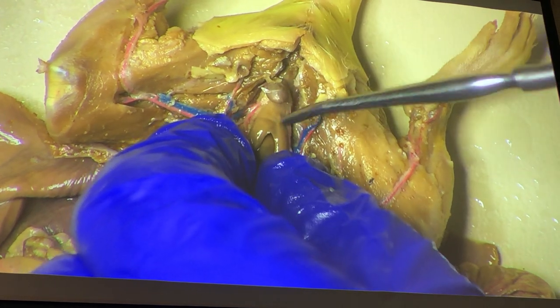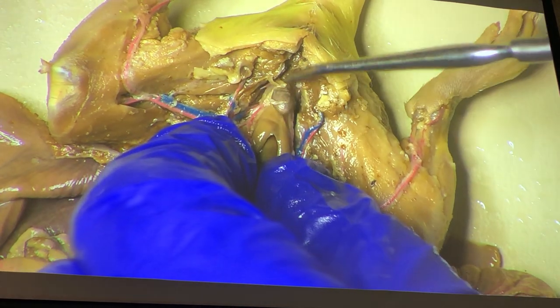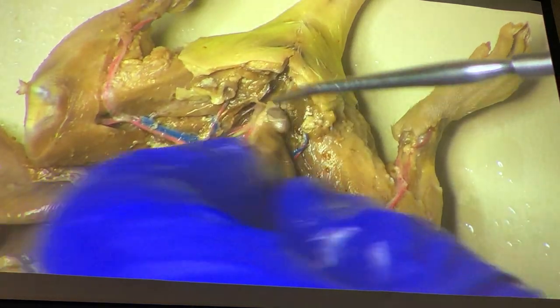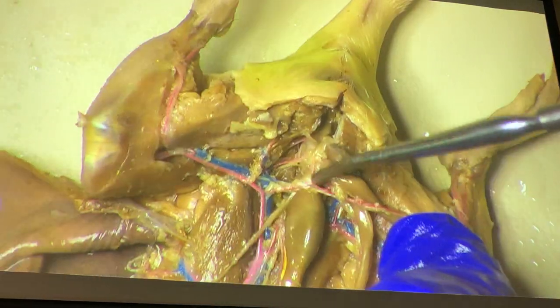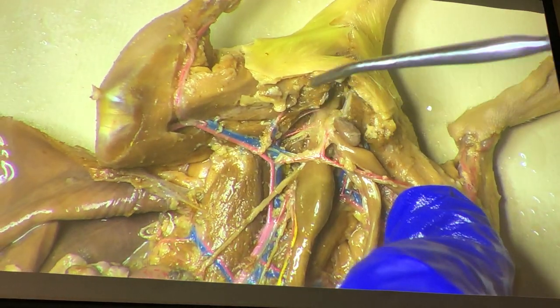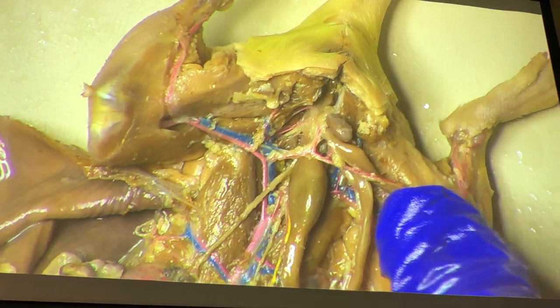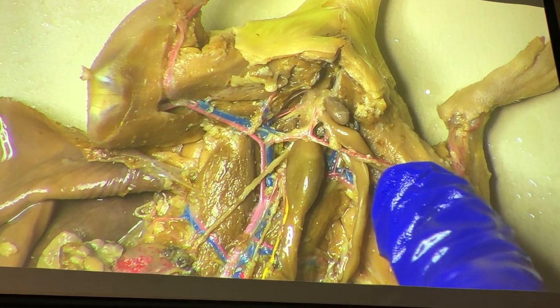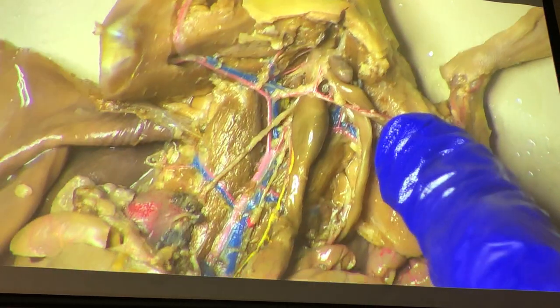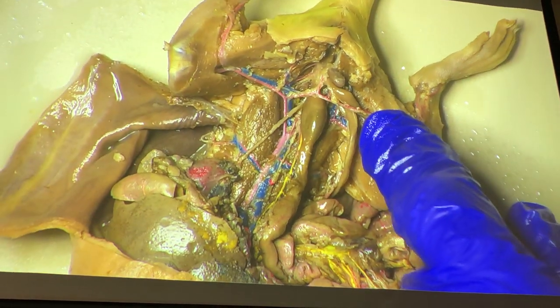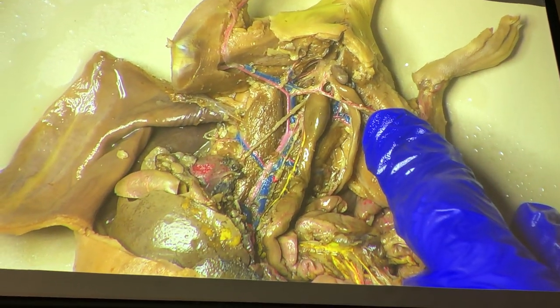Here's the bladder and the urethra, and of course behind all of that — we're in the pelvic cavity — so that's the rectum. You don't have to worry about finding the anal canal; think about it, a human anal canal is two inches. Scale down to the rat — think about how much space you're going to have to work with.